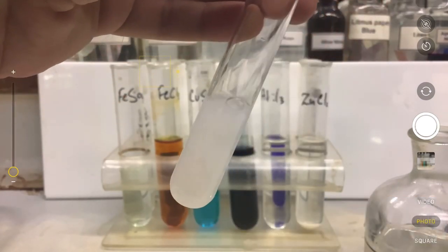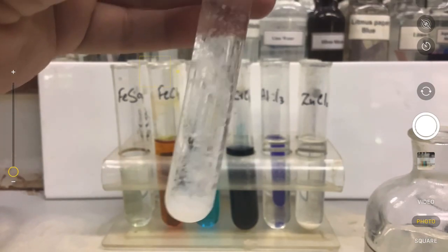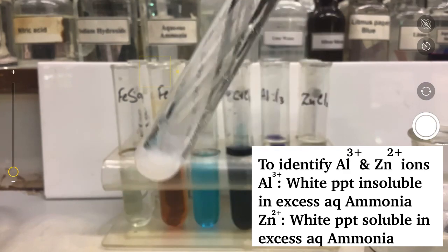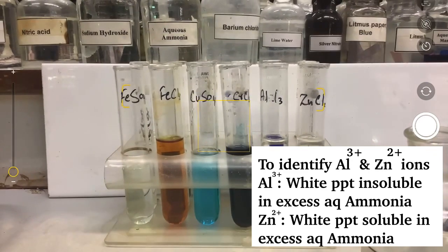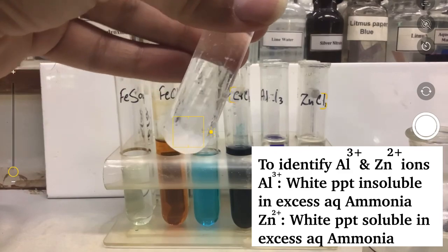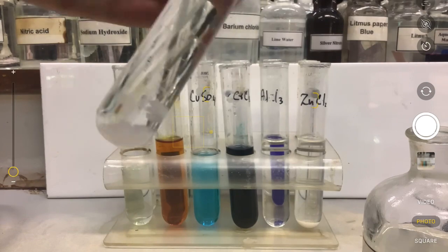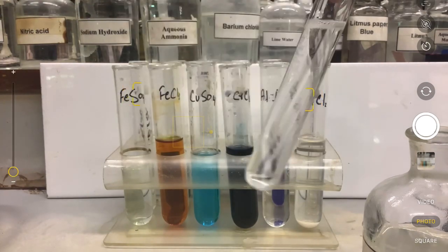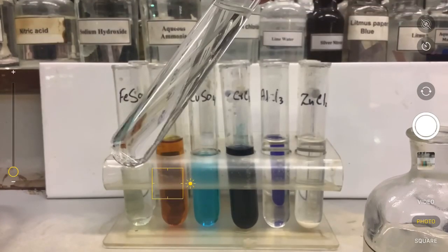But this time, the white precipitates will dissolve in excess aqueous ammonia. So the white precipitates of aluminium hydroxide were not dissolving in aqueous ammonia, but white precipitates of zinc hydroxide will definitely dissolve in aqueous ammonia. This is how we distinguish between the samples of aluminium and zinc using aqueous ammonia solution. You will have to shake it vigorously like I am doing right now, but at the end of the day they will dissolve. This is how you distinguish between zinc ions and aluminium ions.